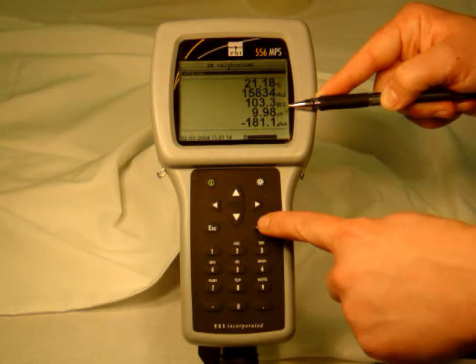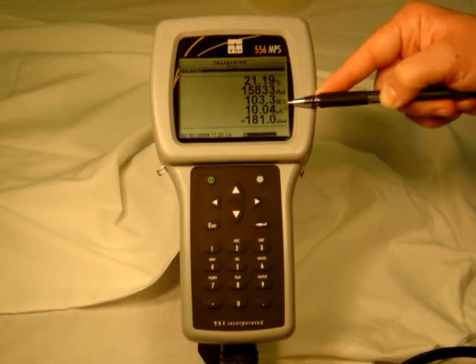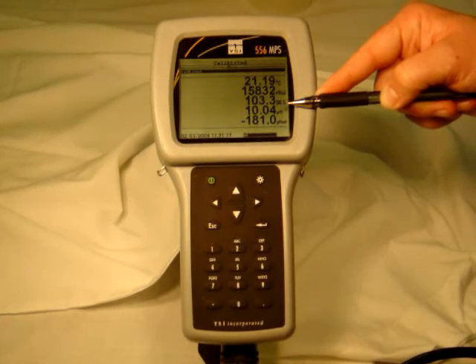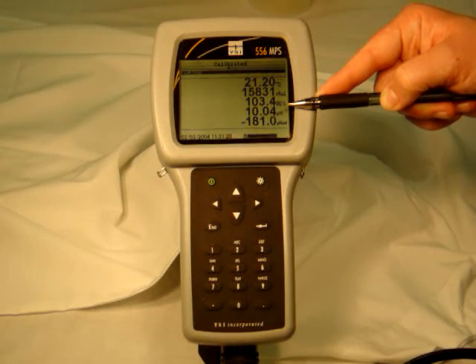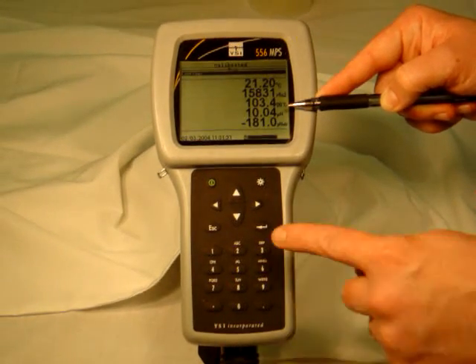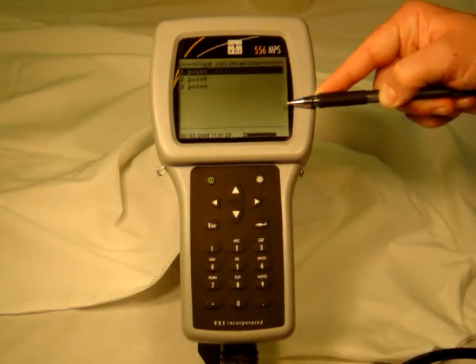I'm gonna go for it. Show stability. Continue.